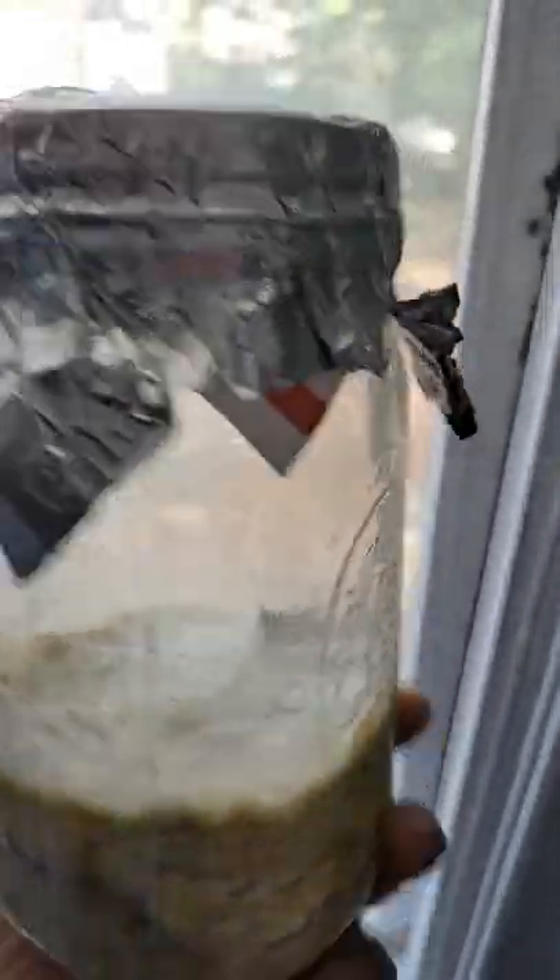These are some older jars that I have sitting on a windowsill. They've been going for about a month, so they're ready to fruit, and you can kind of see they're starting to poke up little nubbins. The sunlight helps trigger fruiting.